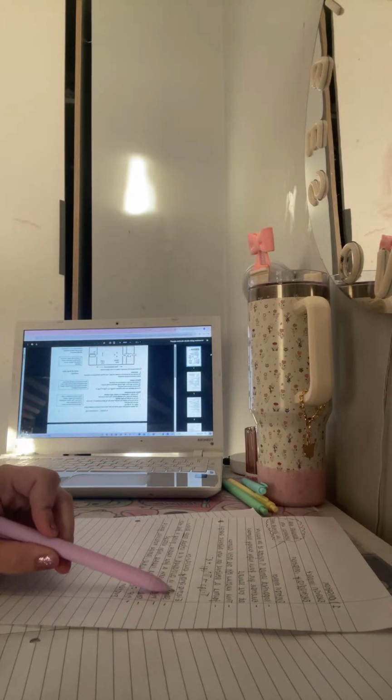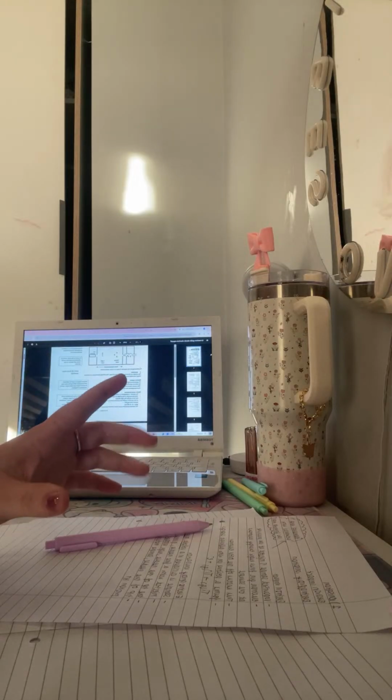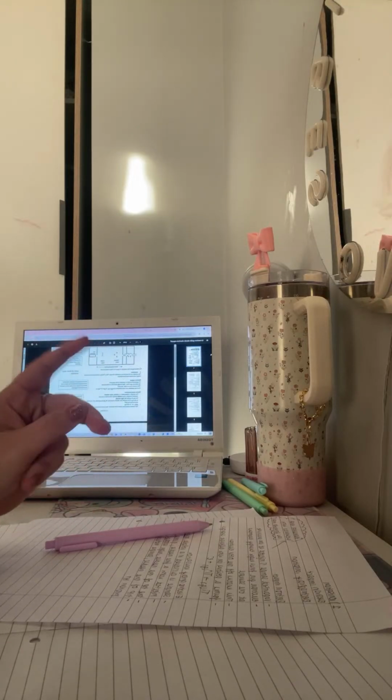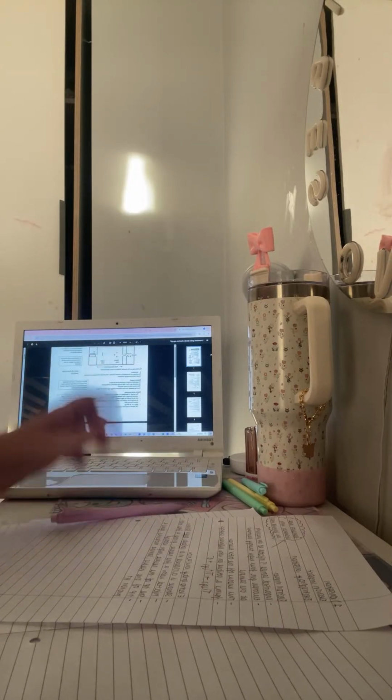So, electrospray ionization. The sample is dissolved in a volatile polar solvent, then injected with a fine needle, giving a fine mist or aerosol.